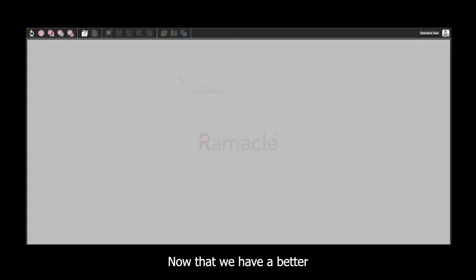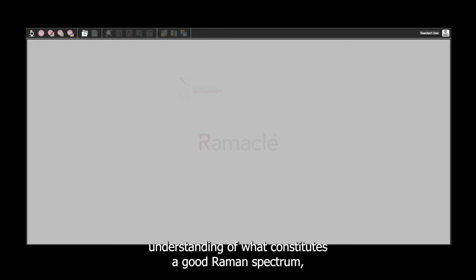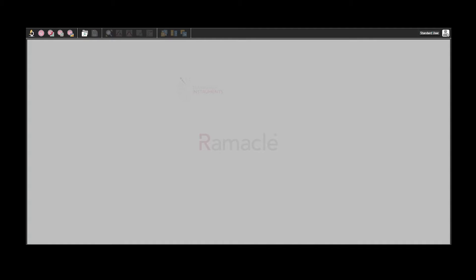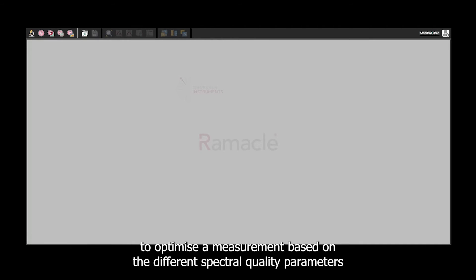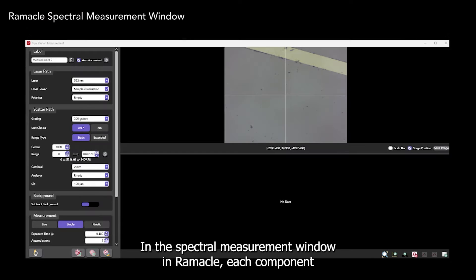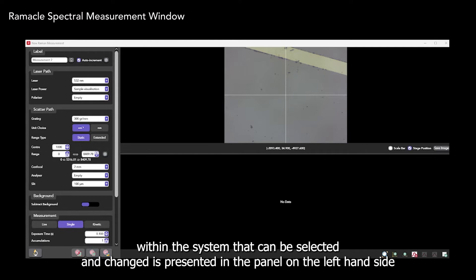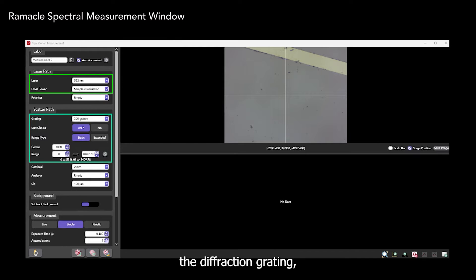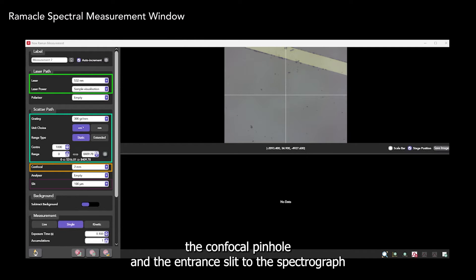Now that we have a better understanding of what constitutes a good Raman spectrum, let's see how each computer controllable component can be configured in Ramico to optimize our measurement based on the different spectral quality parameters. In the spectral measurement window in Ramico, each component within the system that can be selected and changed is presented in the panel on the left-hand side. These include the laser, the diffraction grating, the confocal pinhole, and the entrance slit to the spectrograph.